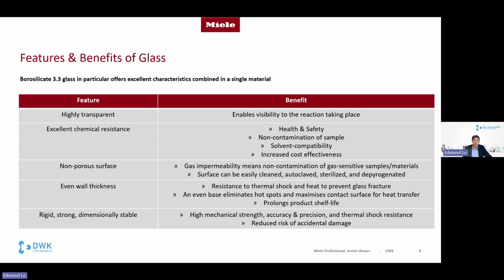With all these features combined, you can go all the way down to liquid nitrogen temperature and all the way up to several hundred degrees. As a material, glass forms a rigid, strong, and stable container as well, as I'm sure many of you already know.